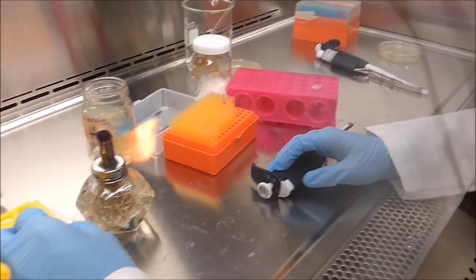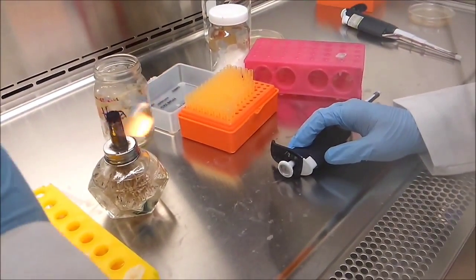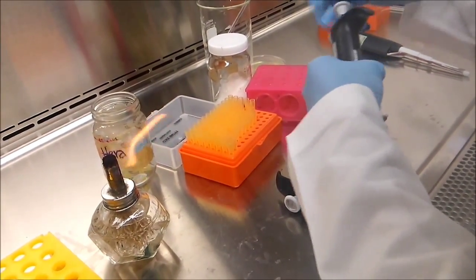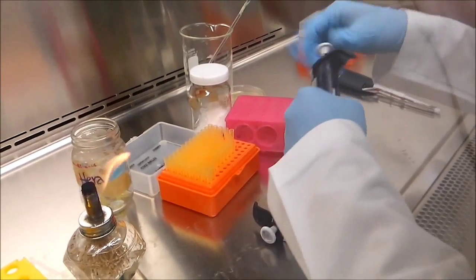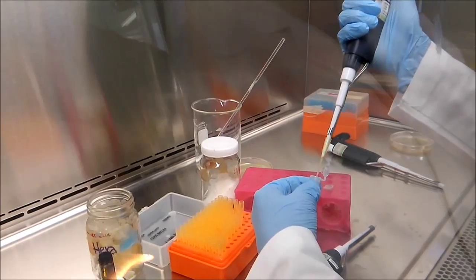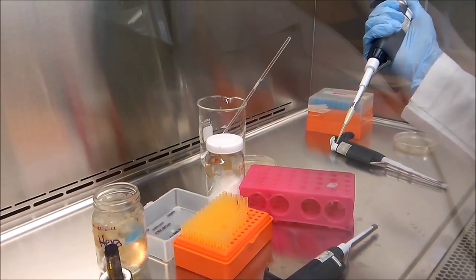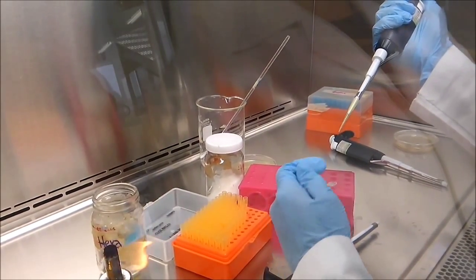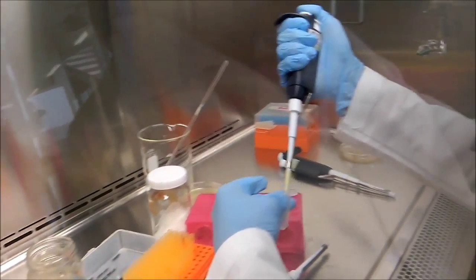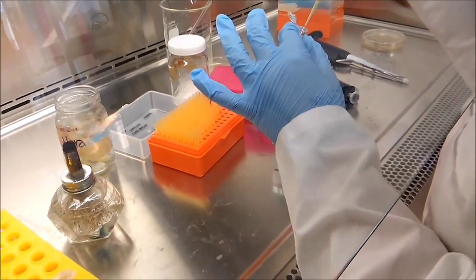Then you add 300 microliters of SOC medium in sterile conditions and then you incubate it at 37 degrees for 30 minutes with agitation at 250 revolutions per minute. Then you spatulate 2 volumes of the different dilutions of the culture on LB plates with ampicillin. You let it incubate for 16 to 20 hours at 37 degrees. After that, you must count the colonies that grew and you will calculate the yield of the transformation.